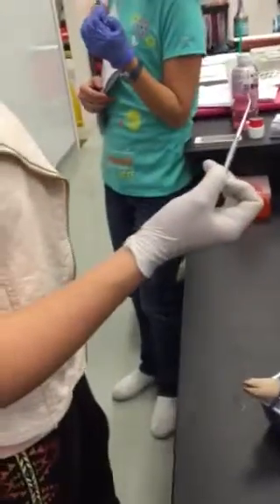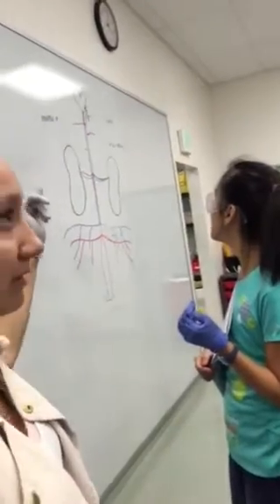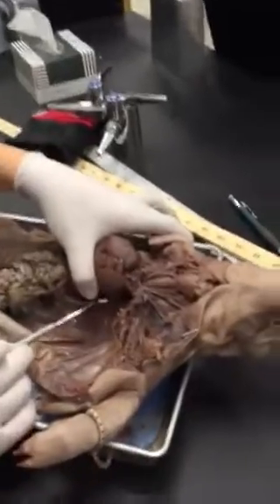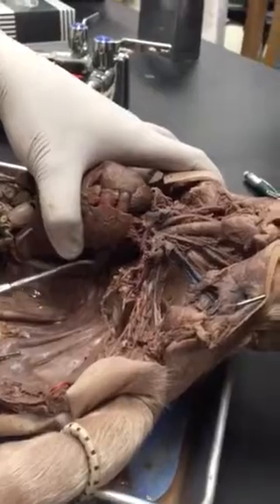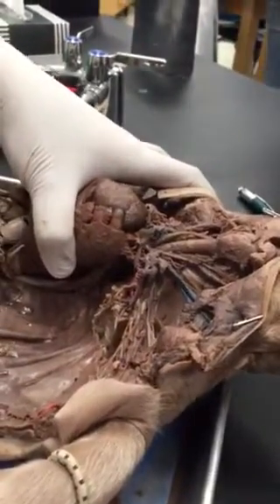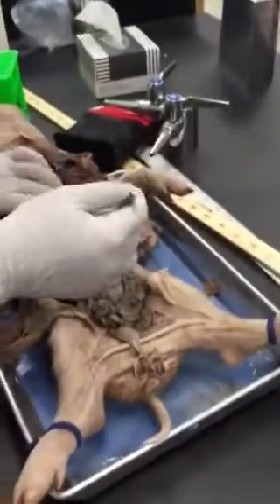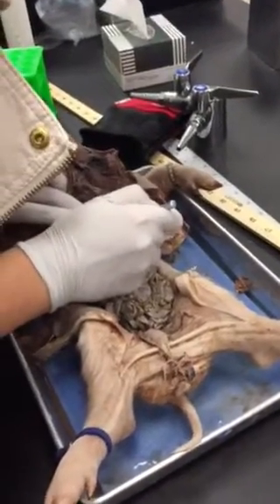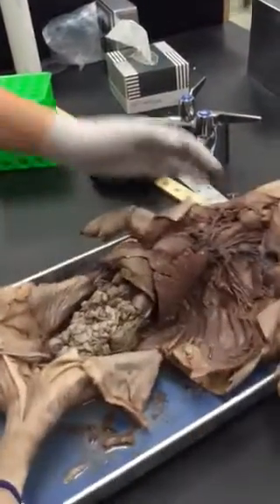Okay? So at the very top above the heart, you see the aortic arch, right? And you see the dorsal aorta curving behind it. You also see that blue vein coming across the top of the dorsal aorta, right? So if we look in here, there's that guy right here. You see that? What is that? That is the azygos vein, which is going to feed the ribs. Okay? And that is in your packet. So if you want to look at it, you see that? Okay, that's azygos.